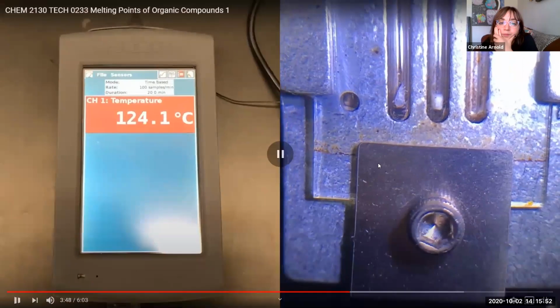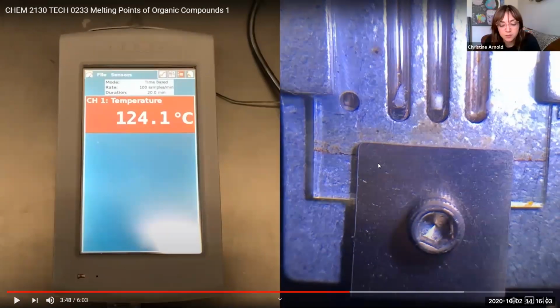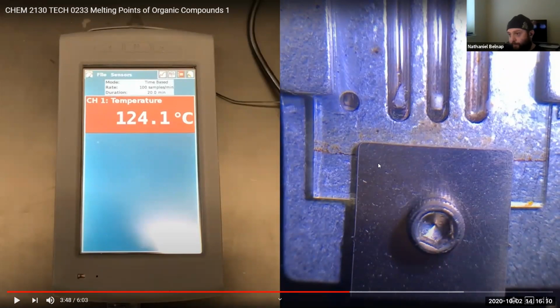So now? So 124.1? Okay, so if everyone wants to write that down, 124.1. And which one is this one? Phenacetin, I believe. Okay. Once everyone writes that down, I'm going to start it back up, and then Christine, tell me when to stop, once you think it's all melted. When it's all melted? Yep.